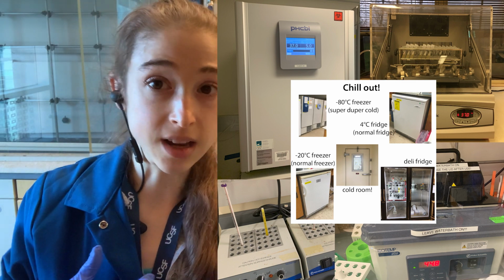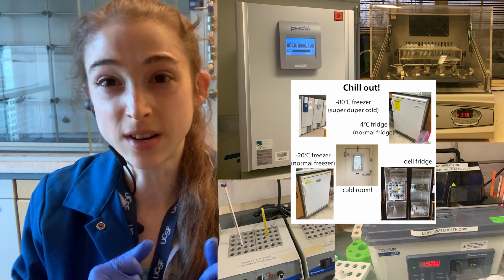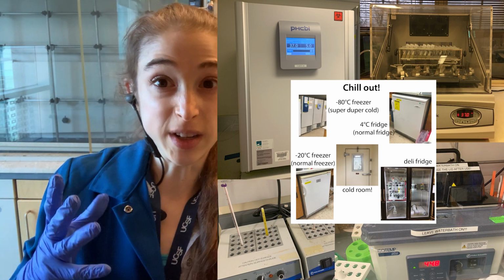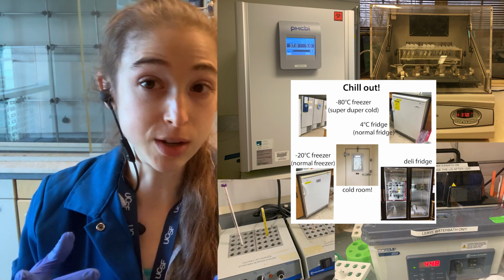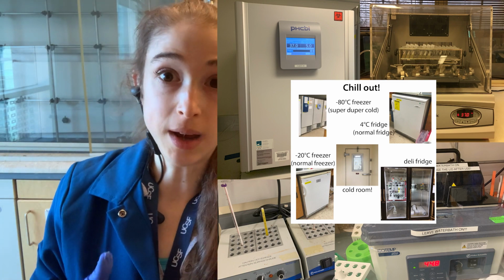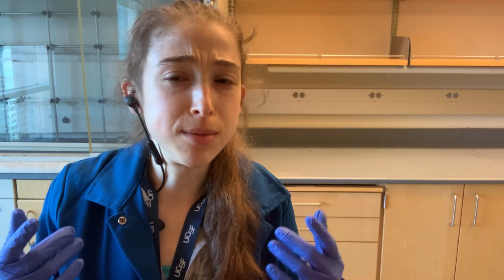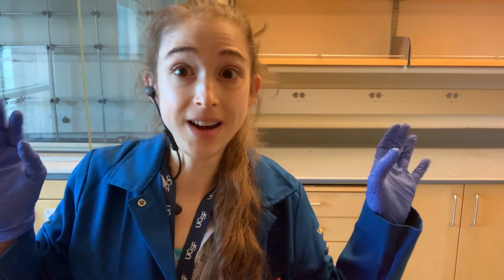And we have various ways to do this depending on how big our samples are, what temperature we need, do we need shaking, do we need stirring, all those various things. So this is just a guide to some of the equipment you might find in a lab for these purposes and when you might use what. But first of all, the most common temperature you incubate things at actually doesn't require anything at all.